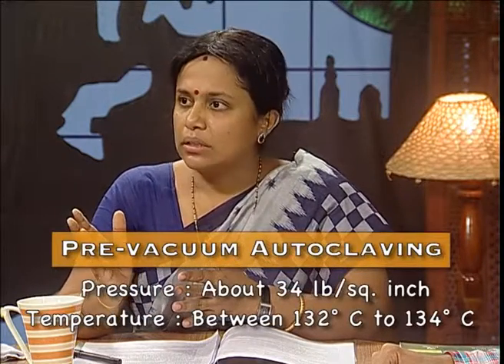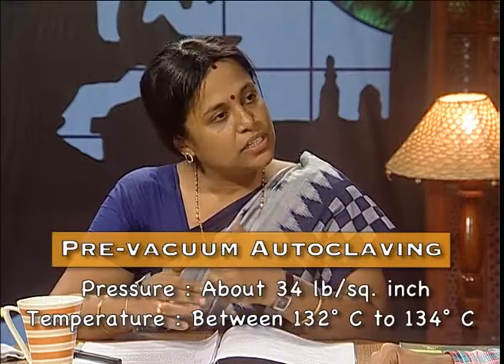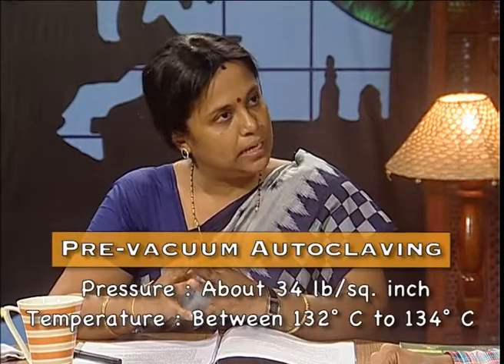Here the pressure is taken up to, I think, 34 pounds per square inch, and the temperature is also raised drastically high. With this tremendous pressure and the higher temperature, the duration of autoclaving is reduced from 15 minutes or half an hour to say 4 minutes.